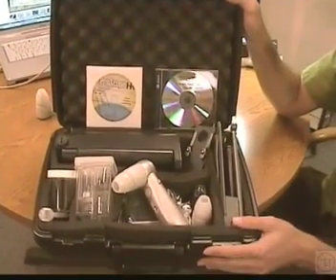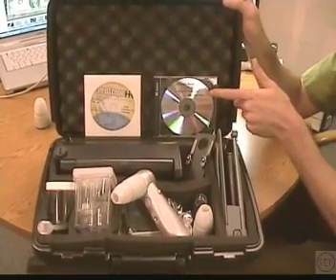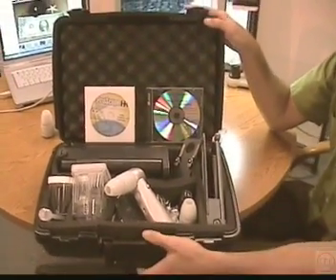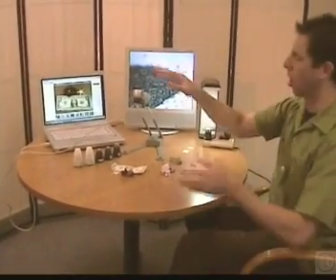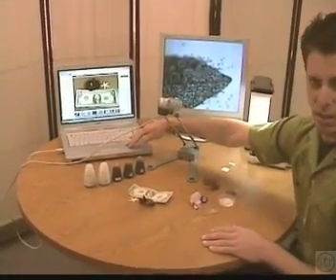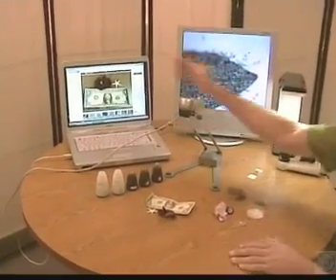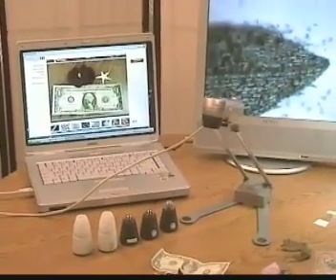This is a ProScope kit with the camera, lenses, accessories, and our curriculum for education that we wrote for the cameras. Now we'll take a look at the ProScope HR — it's the digital version that connects directly to the USB port on a computer. I have it going to my laptop and set up in one of the three modes we're going to look at today.